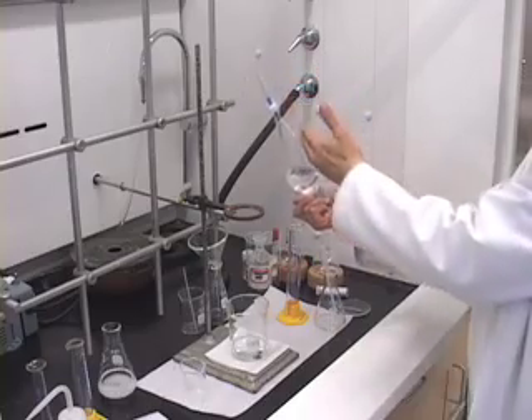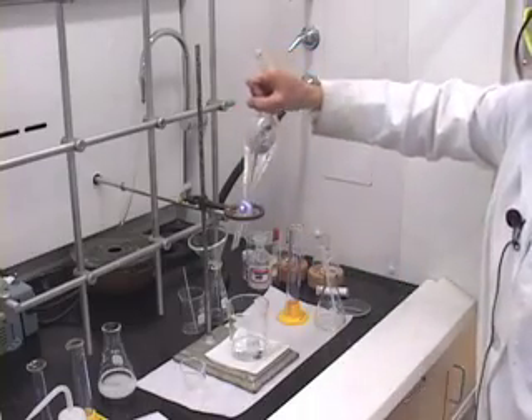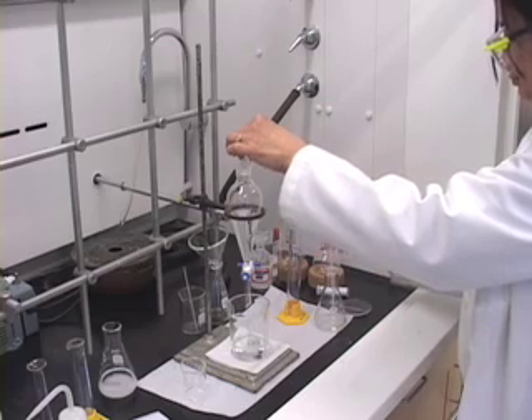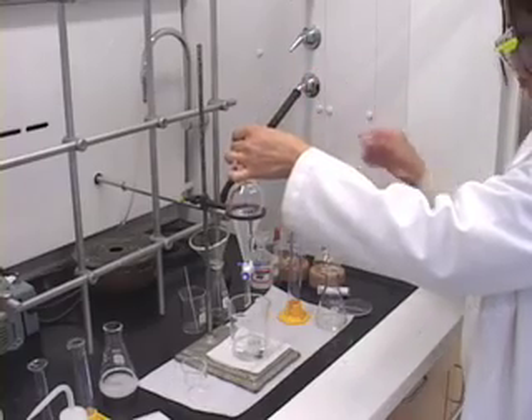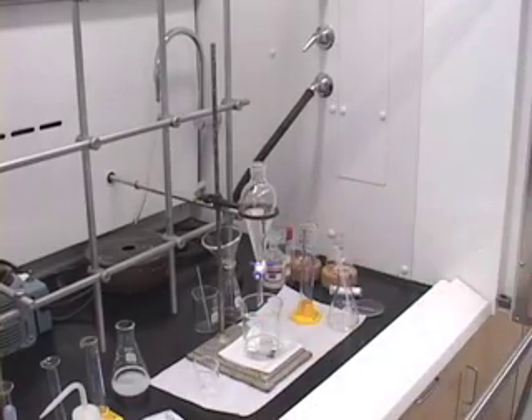Just a few moments for everything to drain back into the separatory funnel. Put the separatory funnel back, rinse the stopper, and wait for the layers to separate.